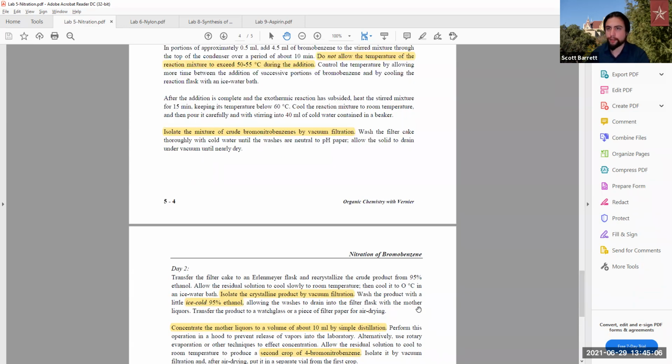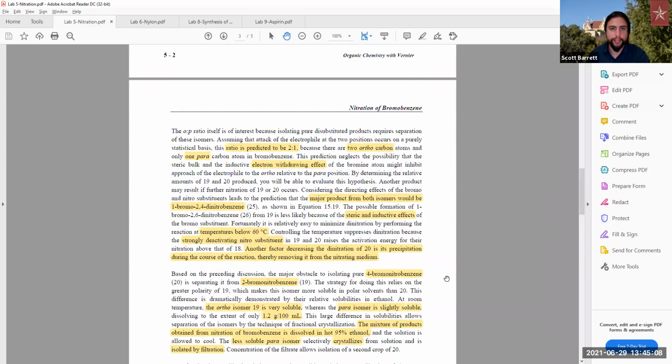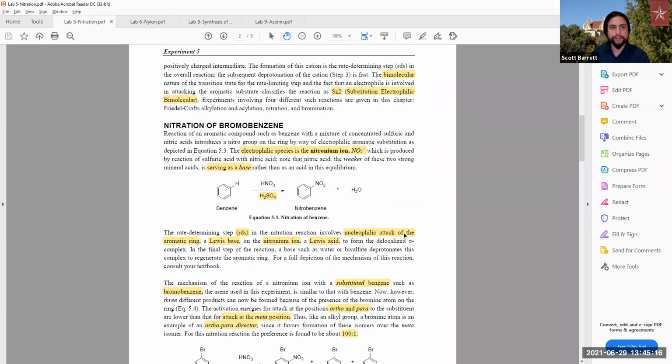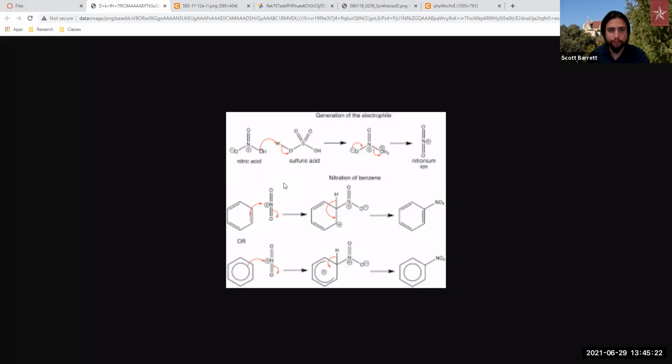Additionally, I could also recommend you to look at NMR spectra. It would be a little bit helpful just because you would see the loss of a proton. But again, the nitro group is not any sort of proton, so you wouldn't see that on a common proton NMR. But the main thing I wanted to show everyone today with regards to that, and I know this is a little lower quality, but I'm going to go ahead and explain through it with this photo as an example.